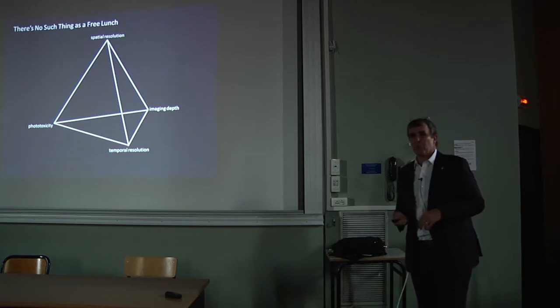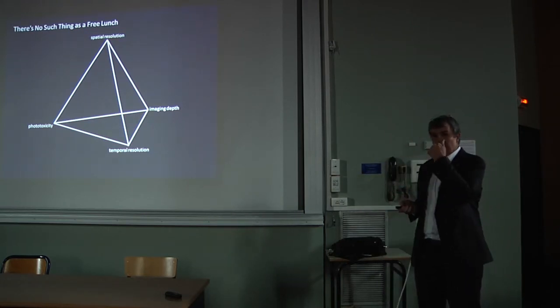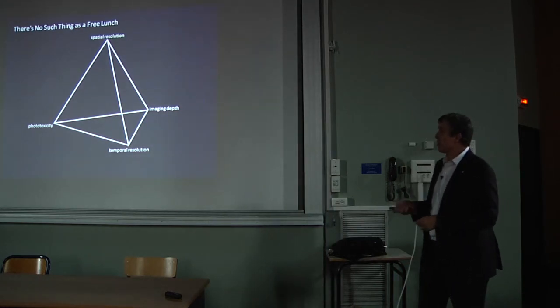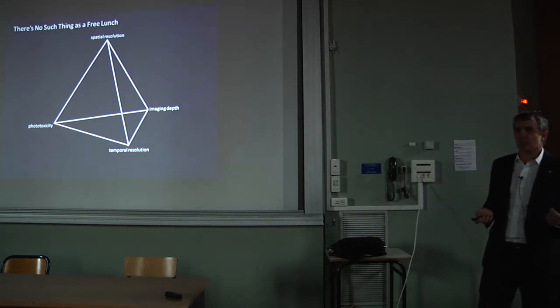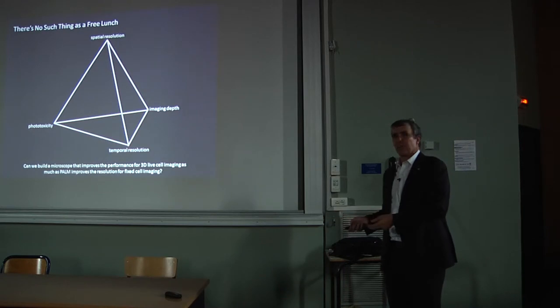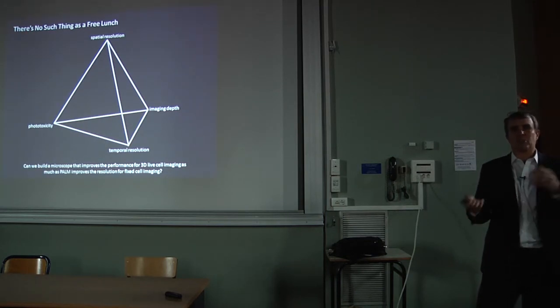So the moral of the story was, if Motz, by backing off from the direction that everybody else in the field was going and saying, I'm happy with 100 nanometer resolution because I can do all of these other live cell things, he had a whole playground to himself in order to do that. So it begs the question, what if we back off even further? What if we go all the way to the diffraction limit? Is there anything we can do to improve live cell imaging in 3D that would be as much of an improvement in terms of the speed and the low damage that we do to cells in imaging them in 3D as Palm was in terms of the spatial resolution?